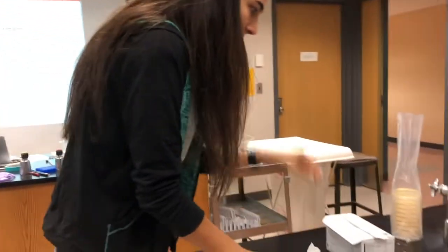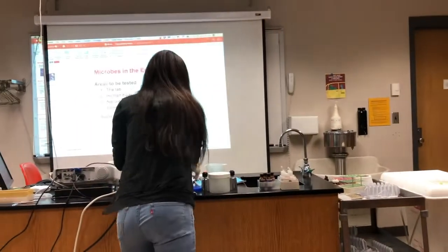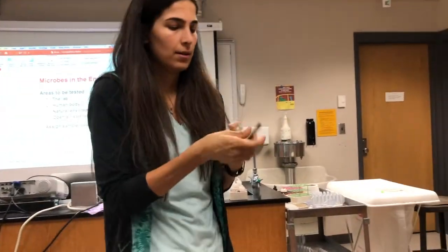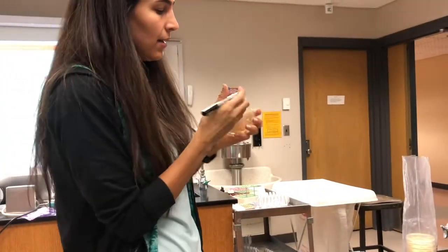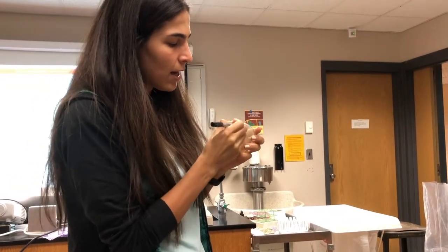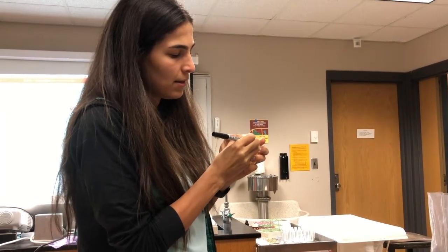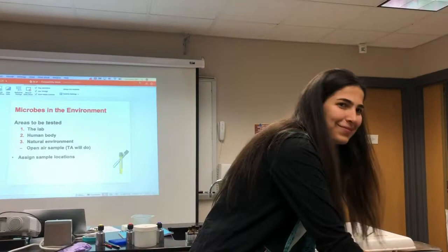Then I will grab another plate, label it again, AG 801 section, this time from clean hand.